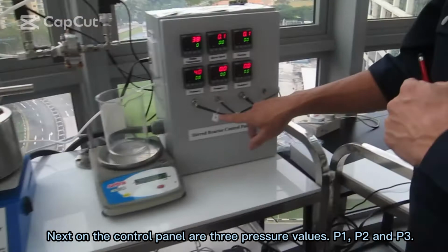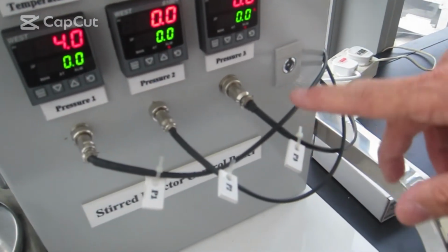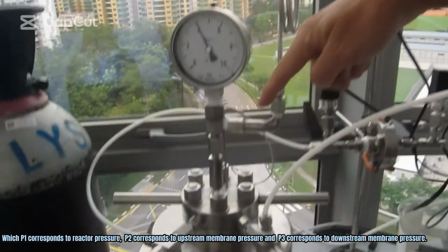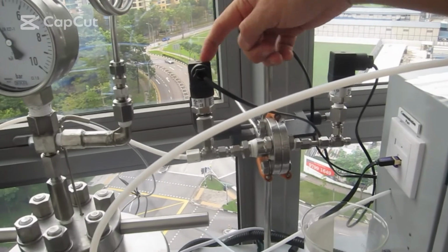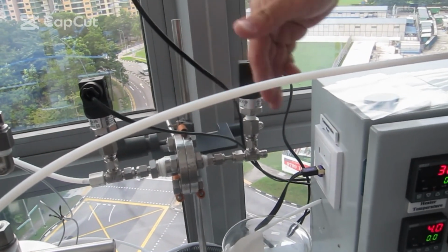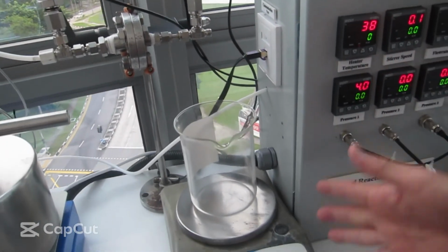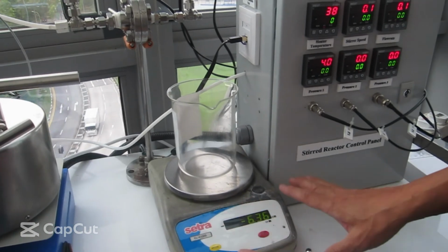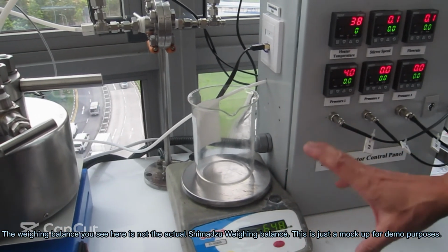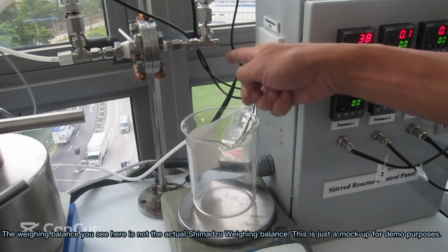Next on the control panel are three pressure values, P1, P2 and P3. P1 corresponds to reactor pressure, P2 corresponds to upstream membrane pressure, and P3 corresponds to downstream membrane pressure. The permeate leaving the membrane is collected and its weight will be constantly measured and recorded by the weighing balance here. The weighing balance you see here is not the actual Shimadzu weighing balance. This is just a mock-up for demo purposes.